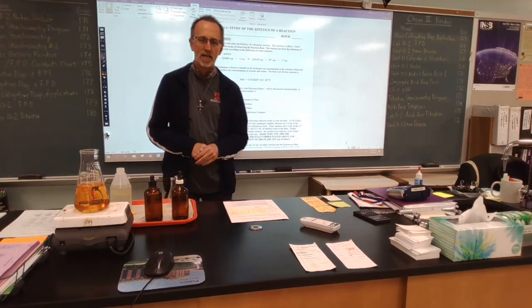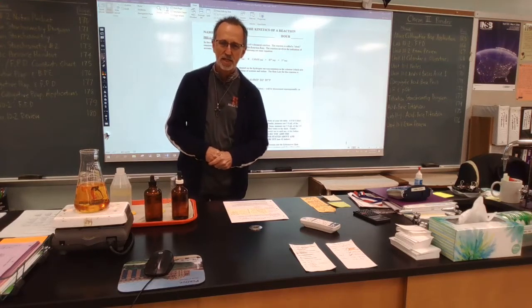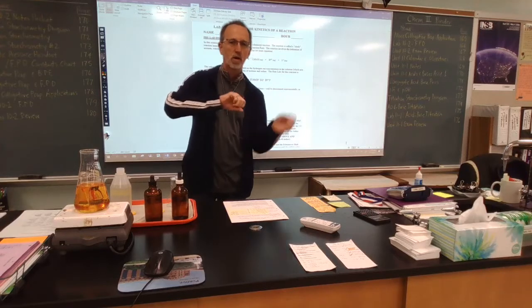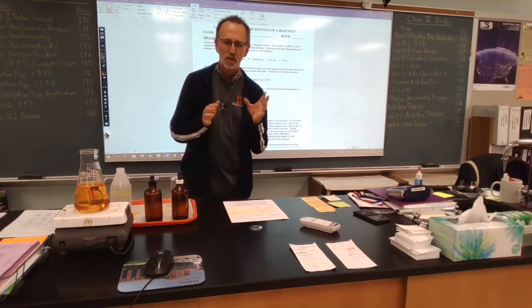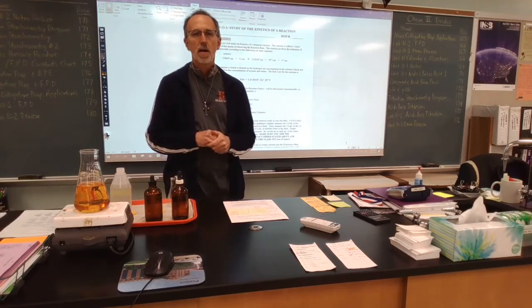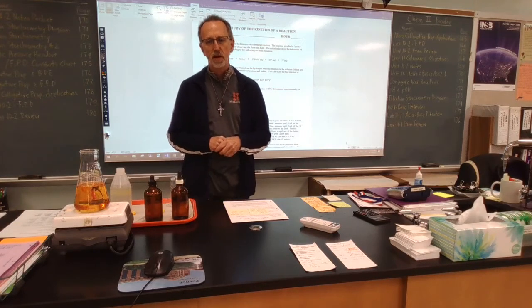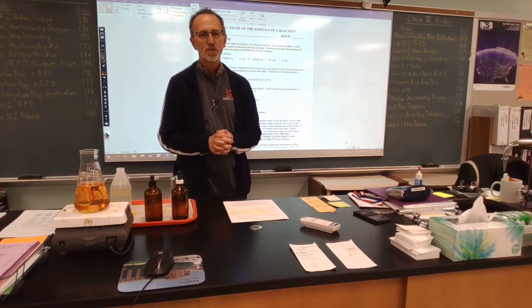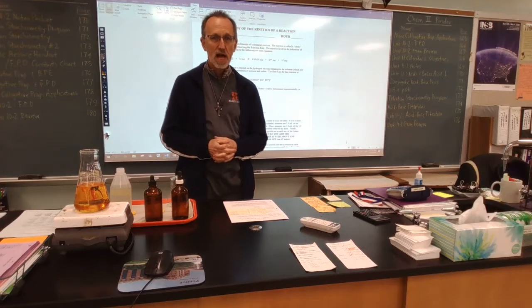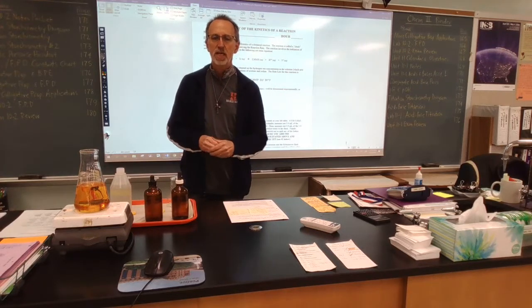On day one back in August, we also reacted two solutions back and forth, and I think they were either both clear or one was maybe cloudy in color, but after time the solution turned a very dark brown color, which was the end of the reaction, or that the reaction had reached completion. It was also a clock reaction, as is this one. We use a clock, so to speak.